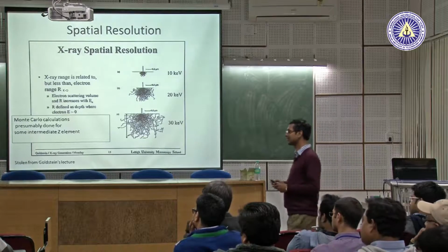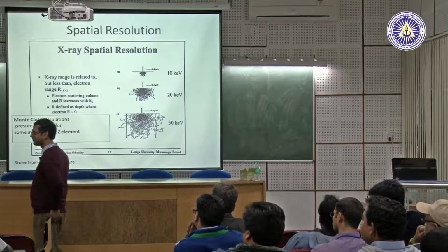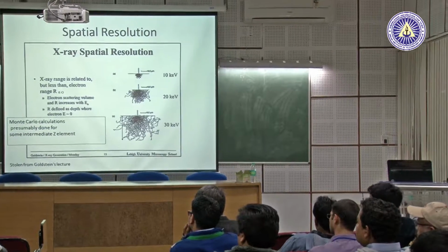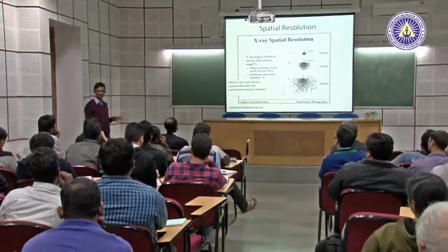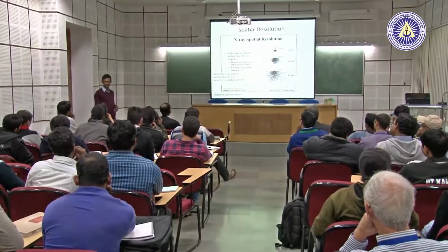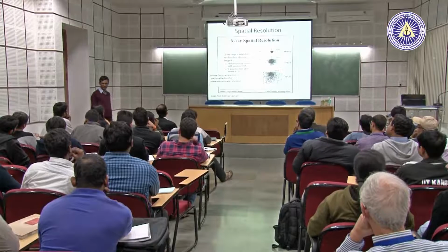Yeah. In case we have low amounts of maybe carbon or oxygen, how reliable is the SEM EDX data? Yeah, carbon is reliable, until you go below carbon. Below that, it's not reliable. Carbon, if we have small quantities, still it will detect and it will give information.